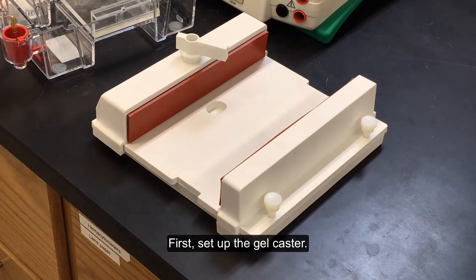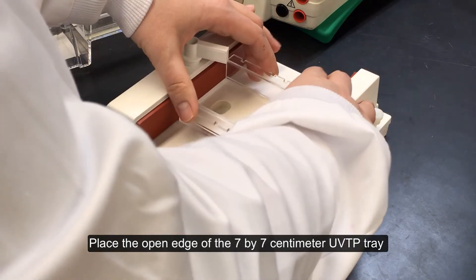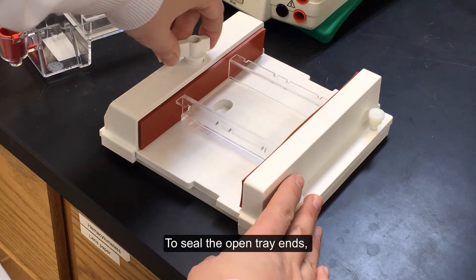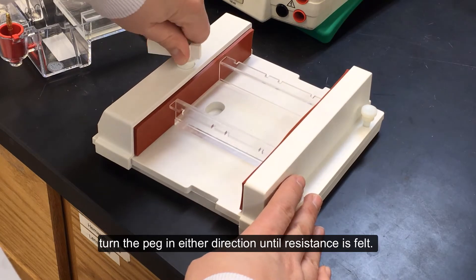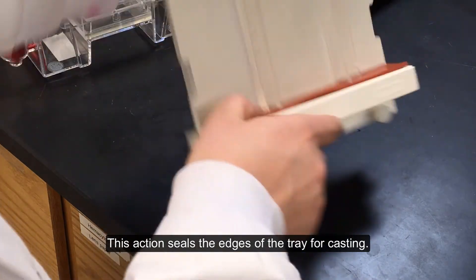First, set up the gel caster. Level the gel caster. Place the open edge of the 7 x 7 cm UVTP tray against the fixed wall of the gel caster. To seal the open tray ends, turn the peg in either direction until resistance is felt. This action seals the edges of the tray for casting.